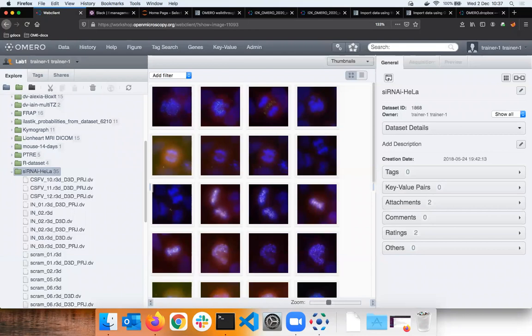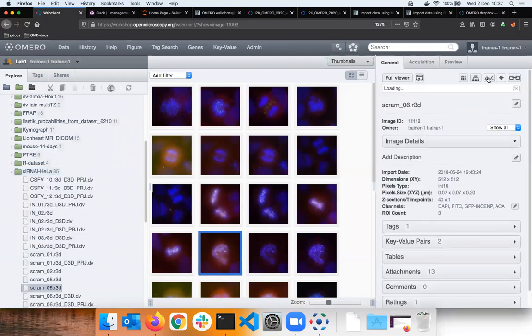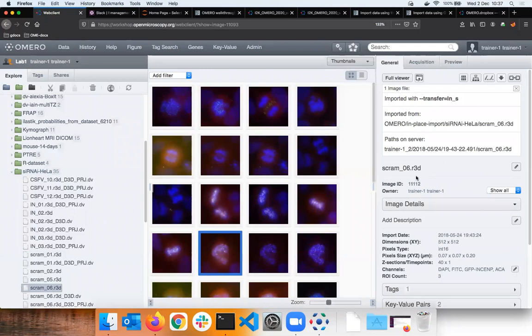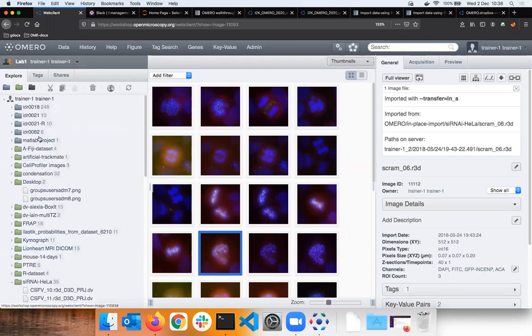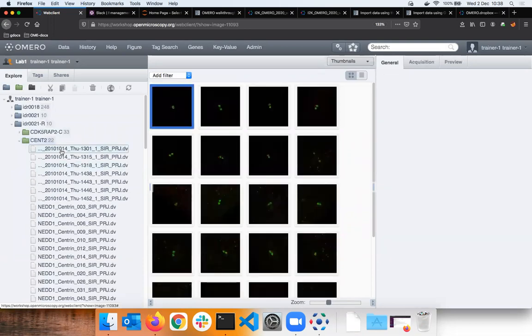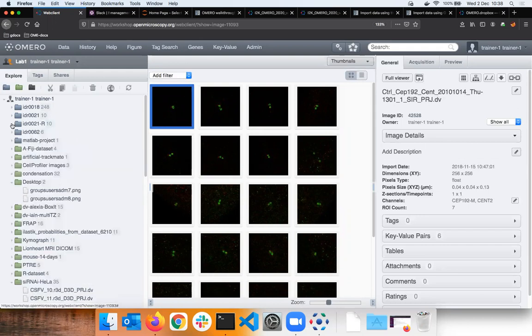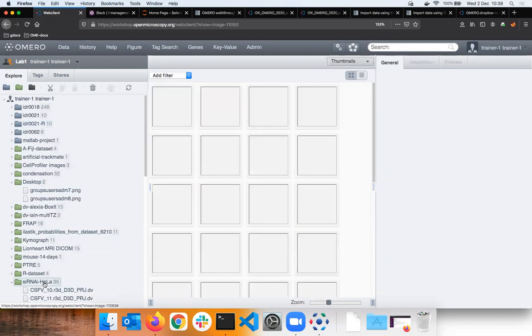If you have, say, the month, the day, the hour, so five or six levels of hierarchy in your file system structure, and then you have the file, when they appear in OMERO, you can only put them into something called project, dataset, and images. It will not match the full hierarchy. It's not like using a tool called Fuse, where you can actually see your file system in another context. It will be the same logic.